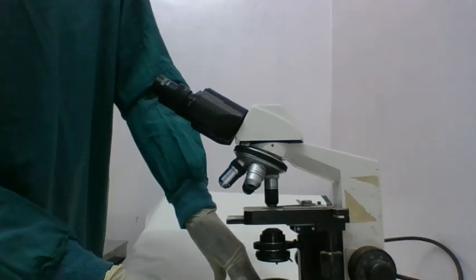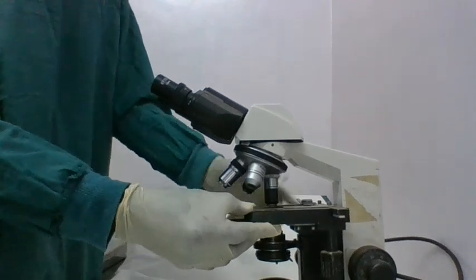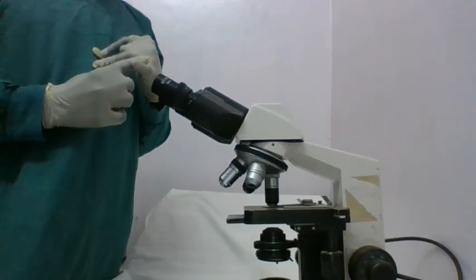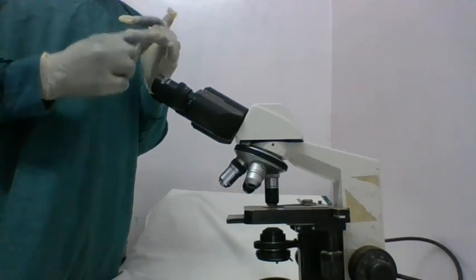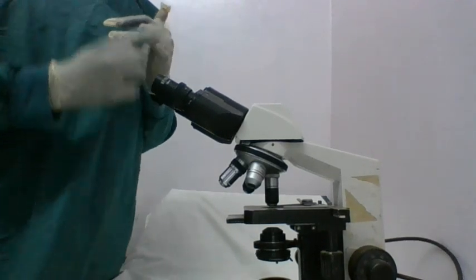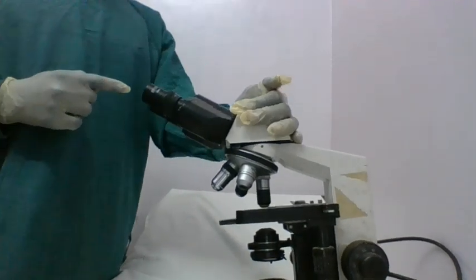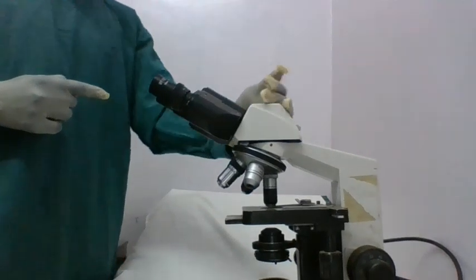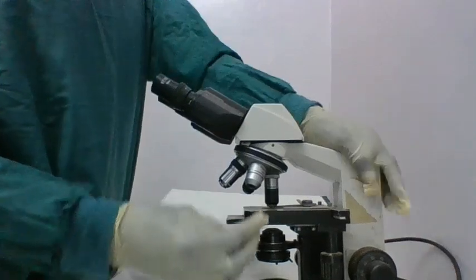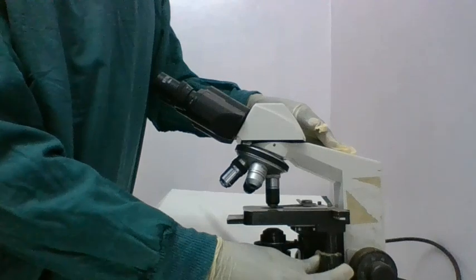So, what are the most common parts of the microscope? It's a very important question. What you need to know about the microscope is always the parts and their use. And even if you're a medical engineer, you need to know how it is maintained and how to do fault diagnosis on your equipment. Maybe this has been brought to the maintenance department, the microscope is faulty, it's not lighting up, or maybe it's not giving a clear resolution. Now guys, you are wondering, what can I do?